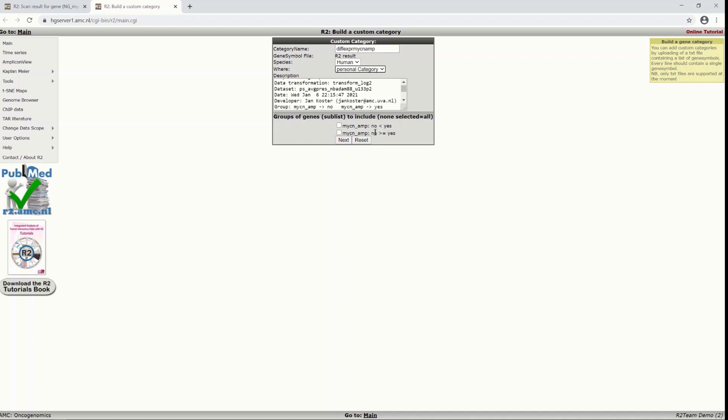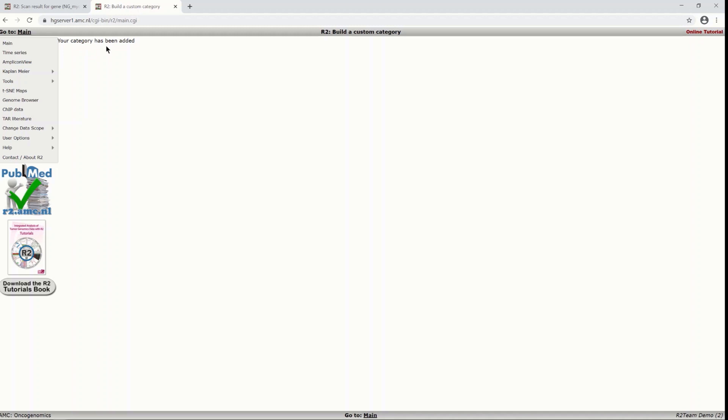And you can click next without checking any, if you just want all the genes from your gene set that you just generated with the analysis and you click next. Your category has been added.